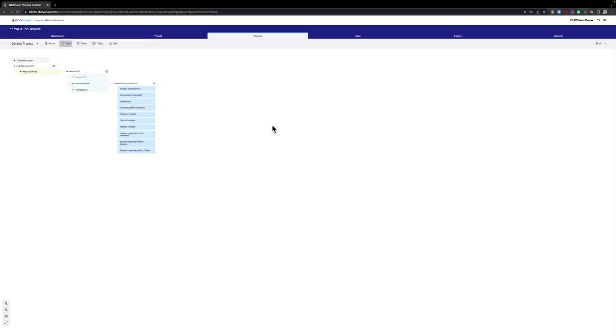Let's take a look. Because the CoA correlates to a specific project, we first need to open that project and make sure the necessary information is there to receive the analytics. I've gone ahead and opened our default process here in this project. Under Process, you will at a minimum have already created a unit operation, added your materials, and some material attributes. The acceptance criteria for your material attributes, remember, will either be set to pass-fail or a range.